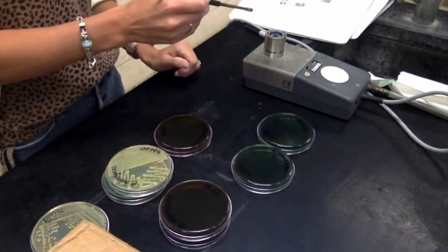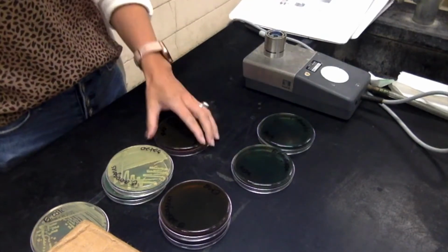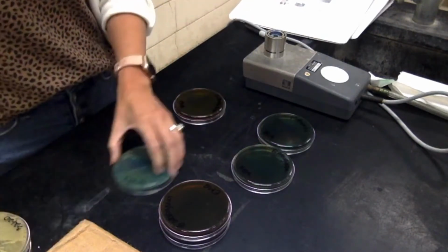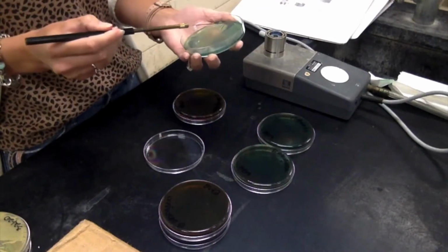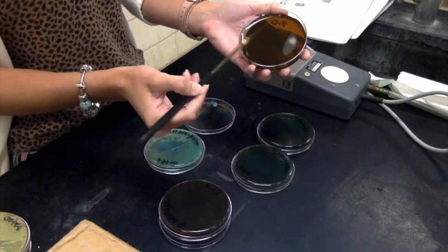Okay. Now, the last one is the Pseudomonas. If you remember, Pseudomonas is the non-fermenter. So, it's gram-negative, so it is going to grow, but it's not going to give me those purple colonies. They're going to be colorless.